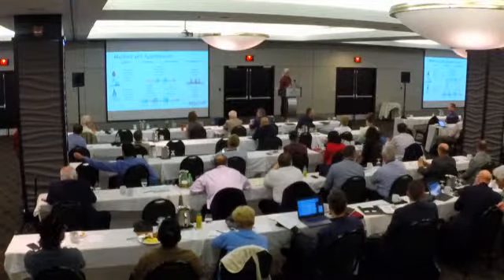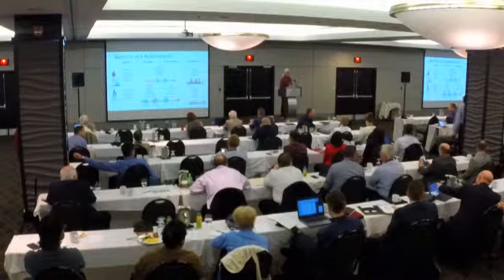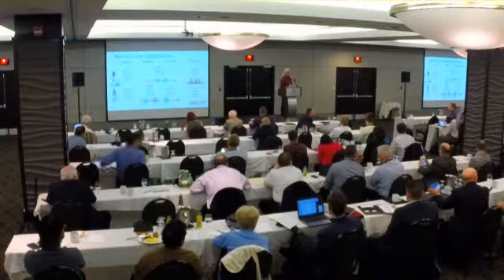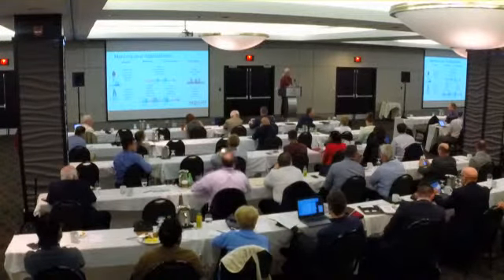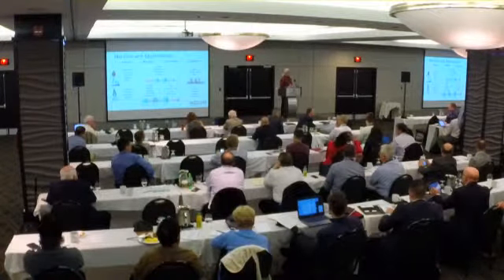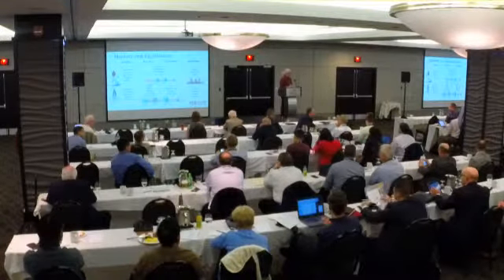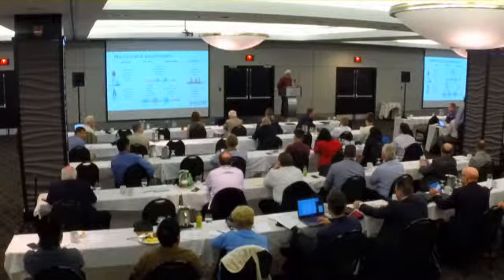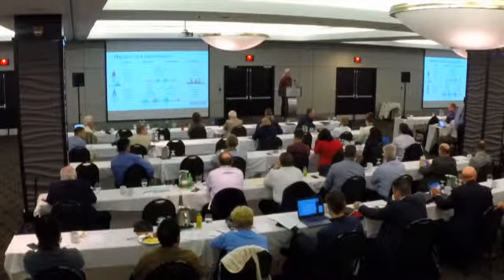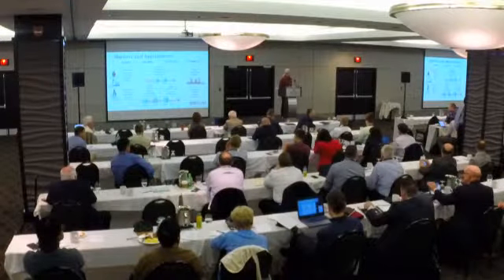I'm Ahmed from Intertech. Personally, I am a big fan of using this IR spectrophotometer in the analysis of the petroleum product, whether it is MIR or NIR. But I know there is some limitation with this technique. Obviously, we are required to analyze different products coming from different sources. So my question is, how much could the matrix interference in terms of the impurity affect the consistency, the precision, or the accuracy of the results?